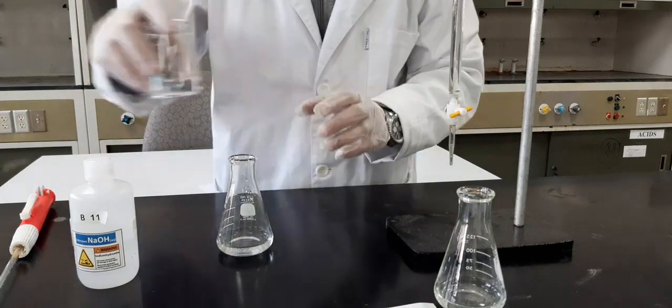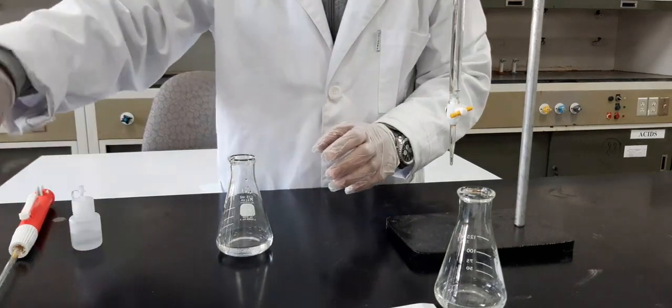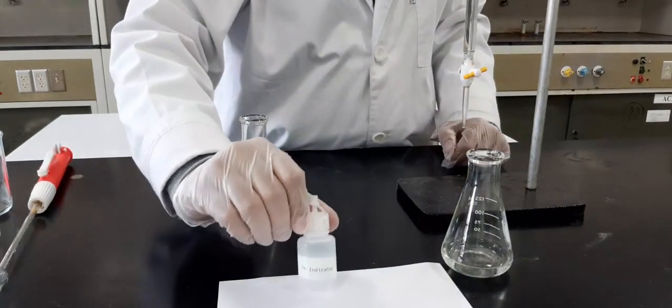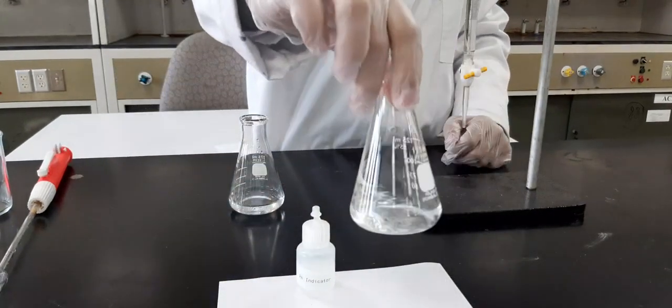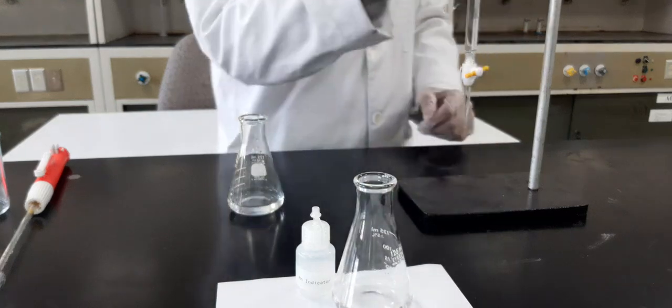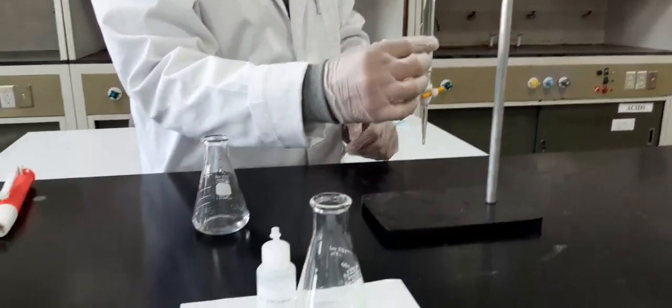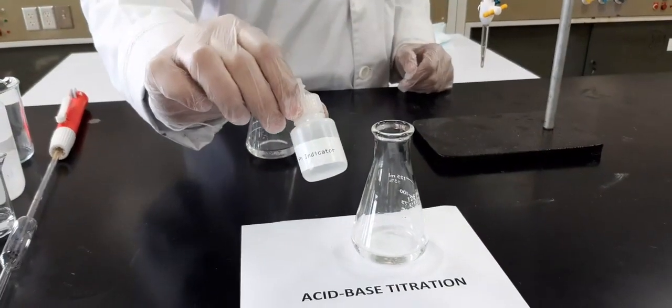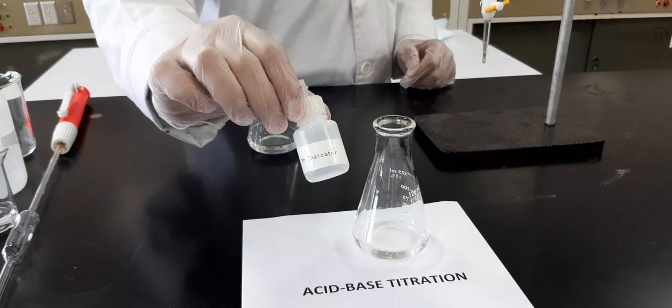Now we will remove anything from my side, so that the main thing, very important, is the indicator, because this solution, as you can see, is colorless. The solution in the burette is also colorless. So whenever the reaction has been completed, we don't know what happens actually. For this purpose, we always use an indicator. The name is phenolphthalein indicator.